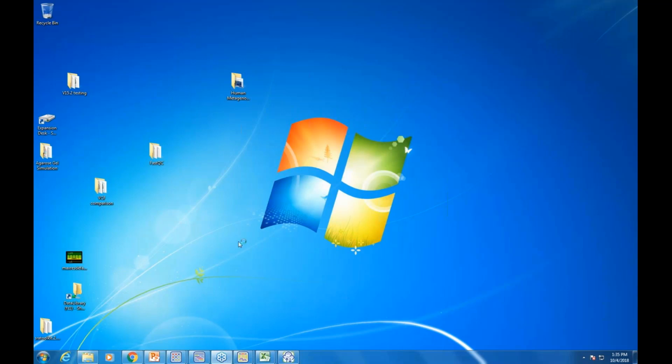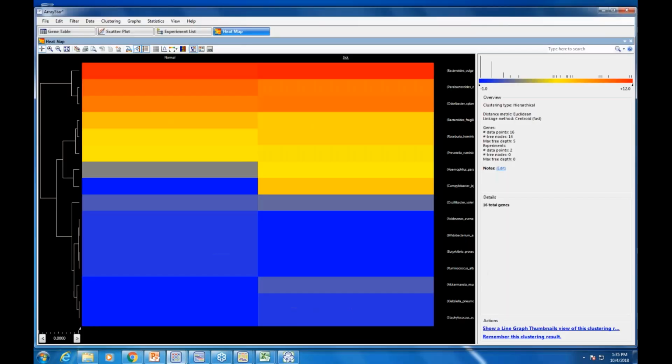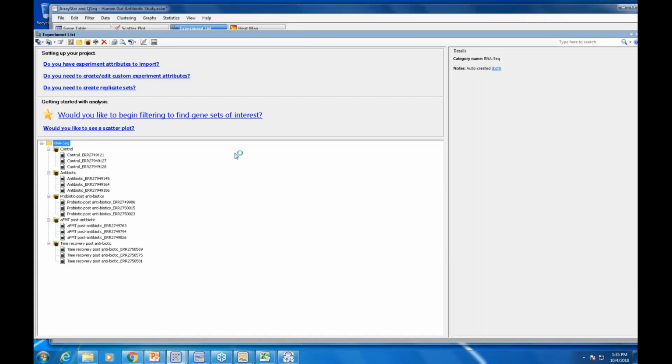If I want the assemblies, I can download those too. Those are a lot larger. They have BAM files and aligned reads. But they'll download. This may take 30 minutes to an hour to download all of them. But what I did in this case is just the ArrayStar project. And nope, not that one. The other one.